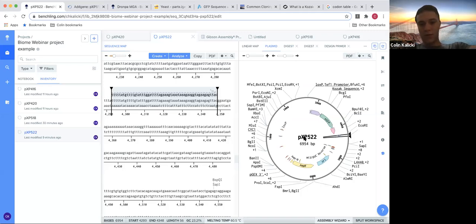Lauren kind of answered that. Good. What was I saying? Oh, we want to save money as much as we can. So one thing we'll do is look at this and say, that's good design. Most likely, like I said, these plasmids have a lot of the same parts.